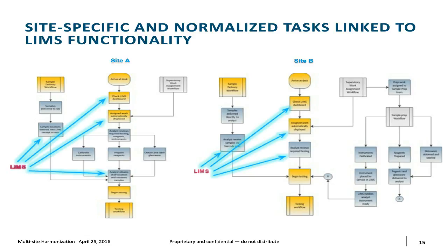If you think about it, in the LIMS world, some of these boxes could, in a future state, in a current state environment, you might have a paper environment where somebody, a supervisor, maybe with a master's degree or a PhD, is checking basically middle school algebra to make sure that calculations were done, to make sure that data entered was properly entered, that somebody didn't write something down that was crazy like a pH of 17 or something like that, or that they did a wrong subtraction to get a net weight for a balance section or something.